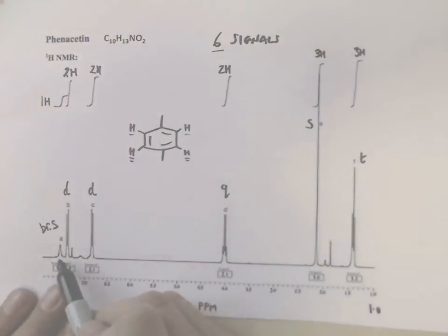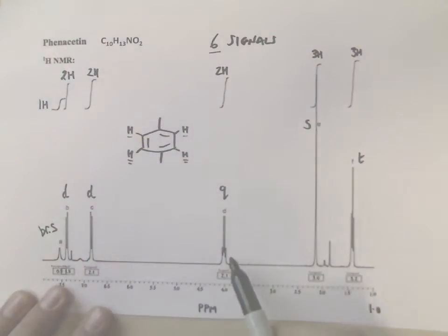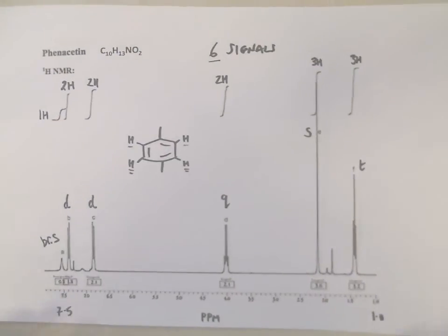But we also have this peak here and these 3 peaks here to consider to make up the rest of the molecule.